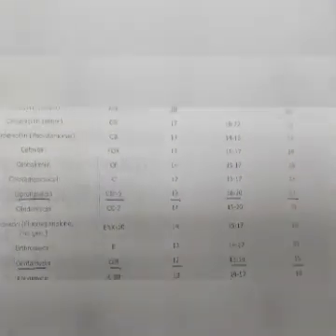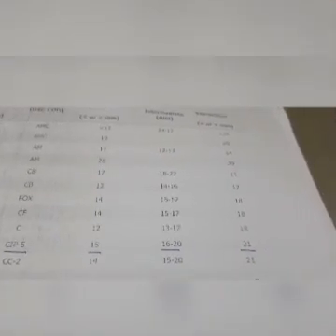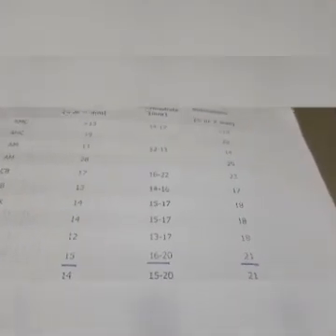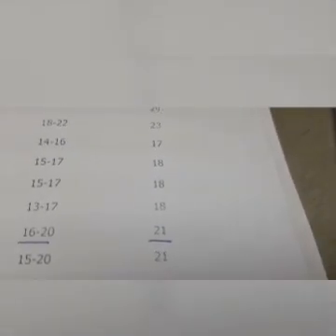Now we can compare the results with the measurements present in the guideline chart. If the zone of inhibition of ciprofloxacin is equal to 15 mm or smaller, then the organism is resistant to it. If the zone is 16 to 20 mm, then the organism is intermediately resistant. Whereas if the zone is 21 mm or above, then the organism is sensitive to ciprofloxacin.